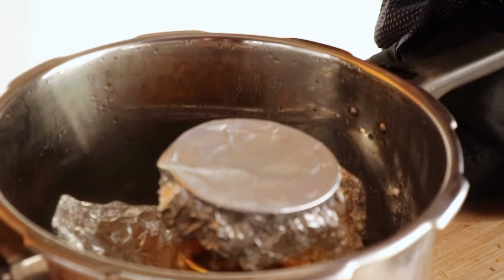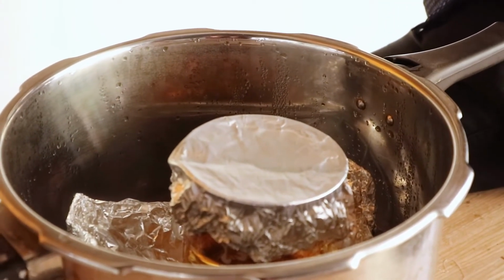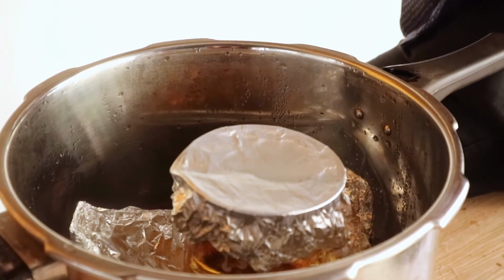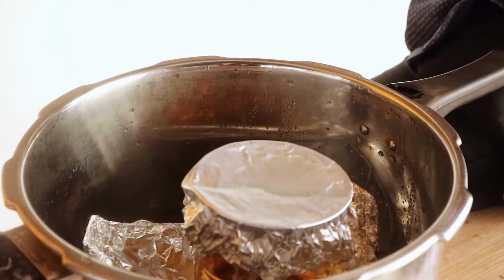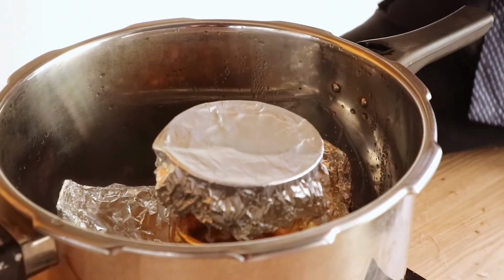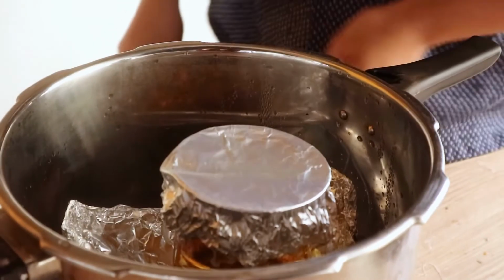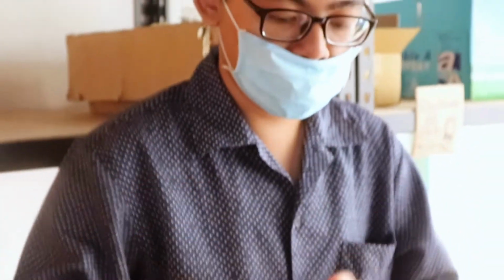You have to wear a mask if you don't want to die. I will die smelling this every day. I smelled this for once, and then I had an illusion that I smelled it everywhere I go. It's very dangerous. It's psychologically shocking. Okay? What you want to do is you use gloves to pick this out of this cooker and put it somewhere safe so your hands won't get burned.